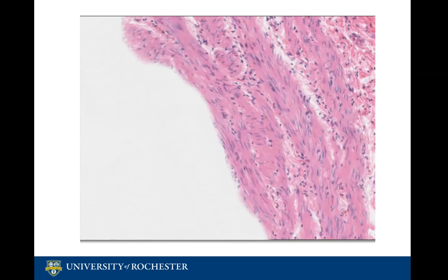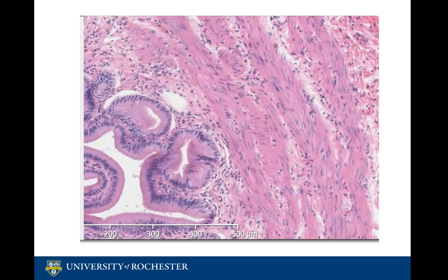Within the muscular layer one can also identify Rokitansky-Aschoff sinuses, an interesting characteristic specific to the gallbladder. These are outpouchings of the mucosal layer within the muscular wall and sometimes subserosal tissue. Also termed entrapped epithelial crypts, these sinuses are not abnormal but can be associated with cholecystitis, inflammation of the gallbladder.